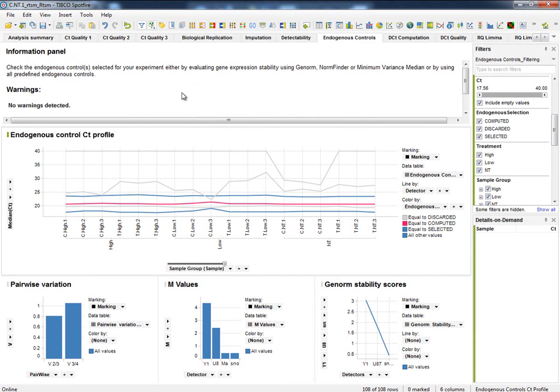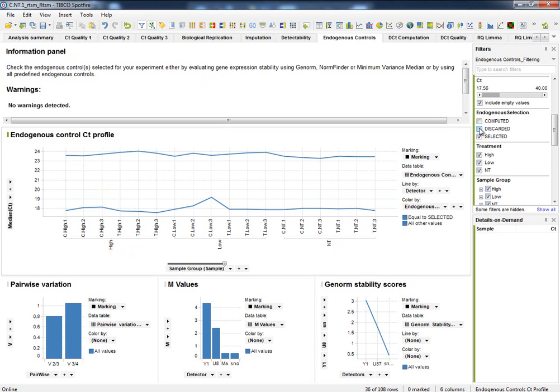Getting into details, this chart shows the CT profile of all our endogenous controls along biological replicates, having a color legend depending on the role they took in the normalization process. The best endogenous controls are in blue. The expression level of an endogenous control is not supposed to be affected by the samples that we are analyzing, neither by their experimental conditions. Therefore, we are expecting to see that our scoring method has selected endogenous profiles with a very low variability, as we can see in this case.